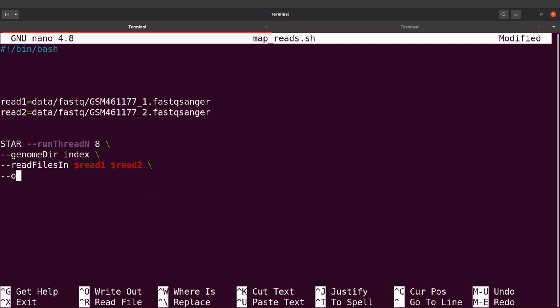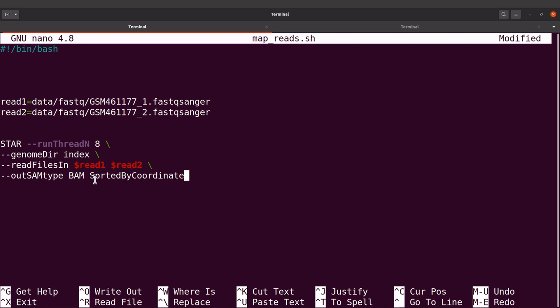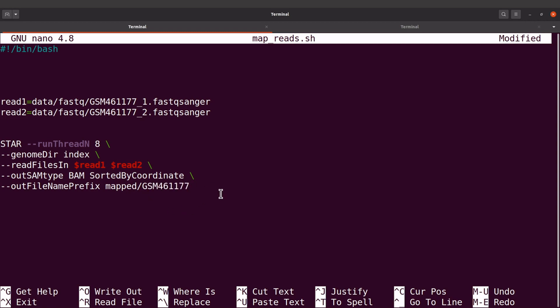I'll also specify --outSAMtype BAM SortedByCoordinate. What I'm saying here is that I want the output file to be in BAM format and sorted by coordinates. I'll then specify --outFileNamePrefix mapped/ followed by the sample ID. That sets the output file name and location.